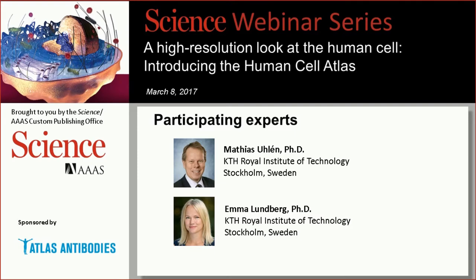The Cell Atlas reveals that approximately half of all proteins localize to multiple compartments, and that many proteins show cell-to-cell variation in terms of protein abundance or spatial distribution. In this webinar, we will introduce our viewers to the new Human Cell Atlas and outline how it is being used to define the spatiotemporal organization of the human proteome at a subcellular level.